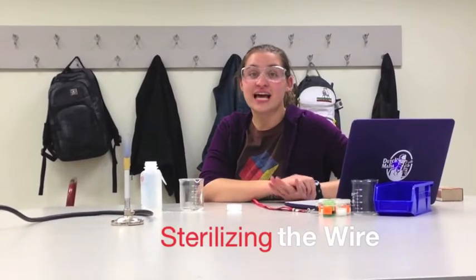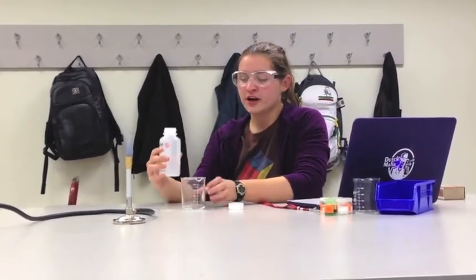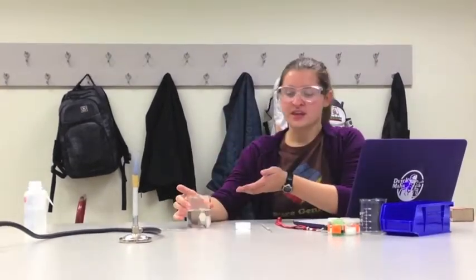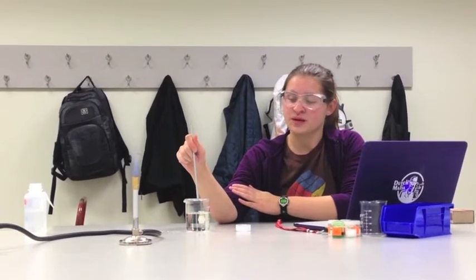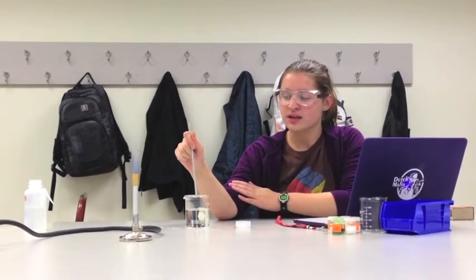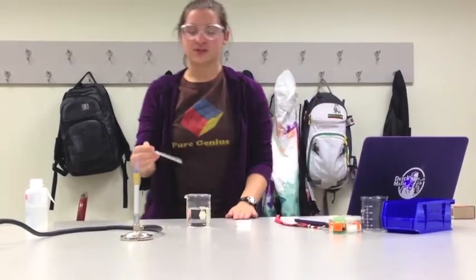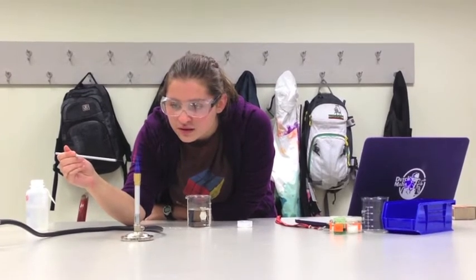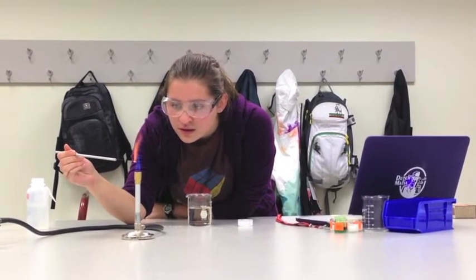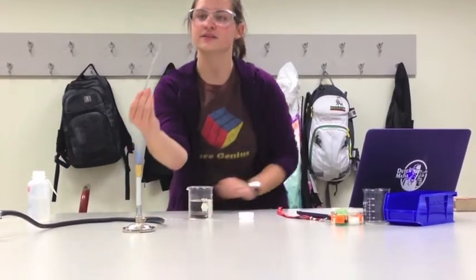So this is how to sterilize your wire. First, you need to take 150 milliliters of distilled water. Then you take your wire and you put it into the water for 5 seconds. 1, 2, 3, 4, 5. Then you hold it out over the flame until the water is dried up and it turns red. Wait for it to cool down before you move on.